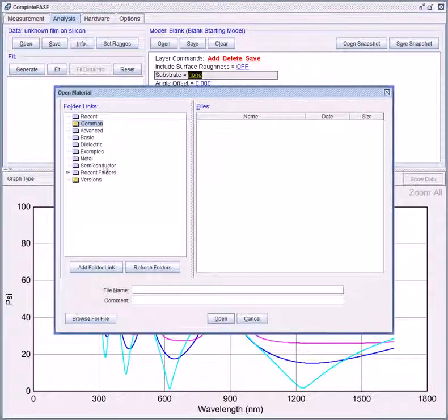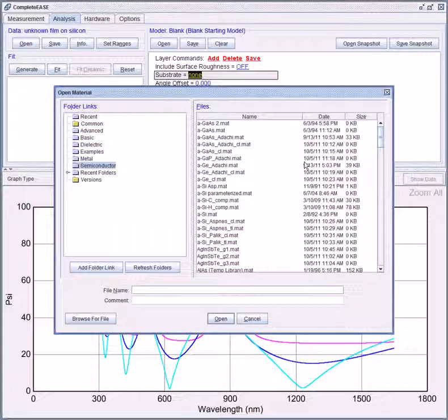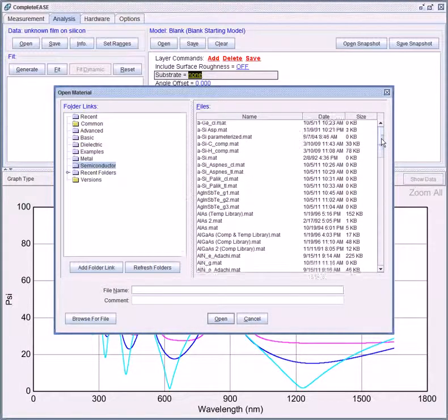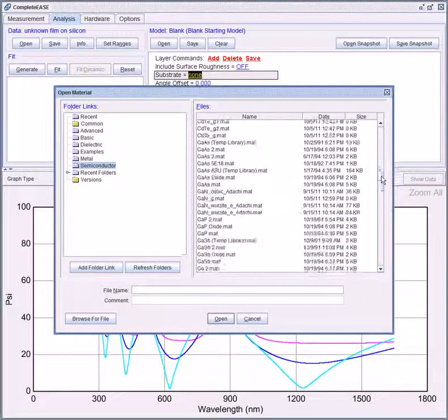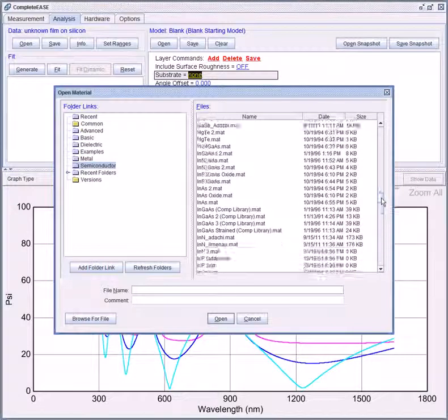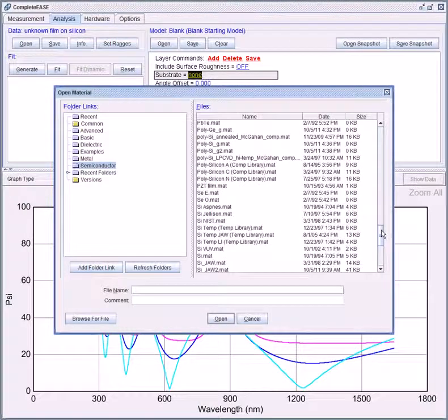In the semiconductor folder you will find various material files for silicon. We usually recommend SI underscore JAW.